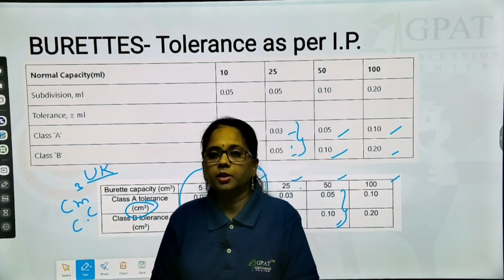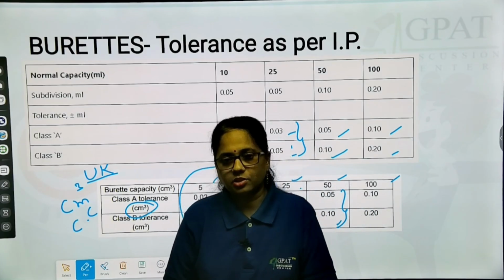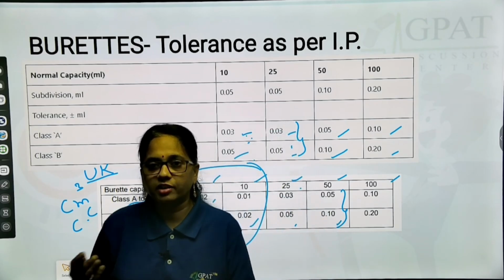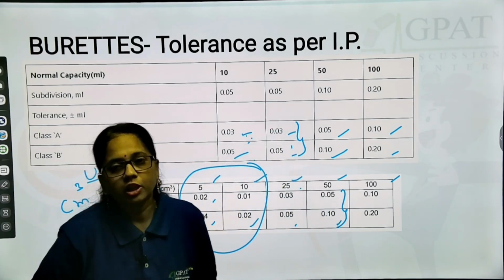That is the main motto of putting in all the standards. According to the different standards we need to follow this. For that purpose only they give the tolerance limits.